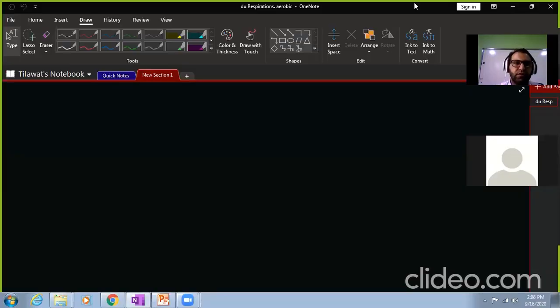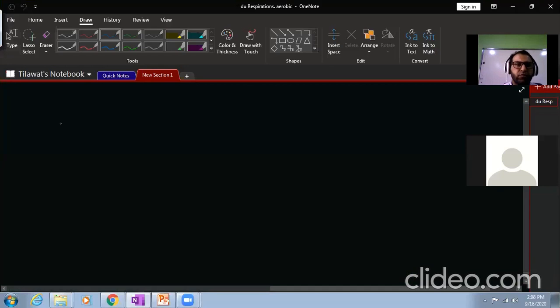All right, so now we already discussed that there is a limitation for the human eye, approximately 0.1 mm object size, right? If the object size is decreasing below this limit, the human eye can't see it.